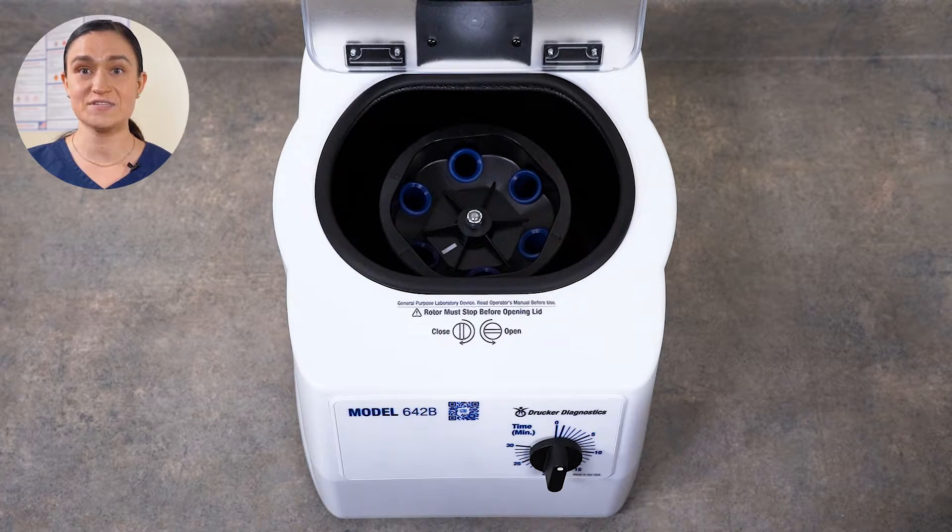They do not click or snap into place. Your 642B has only authentic Drucker Diagnostics parts, including rotor and tube holders. You should only use authentic Drucker Diagnostics parts in your centrifuge, as anything else may damage your centrifuge or even be dangerous. Now that we have our 642B set up, we can look at our controls.